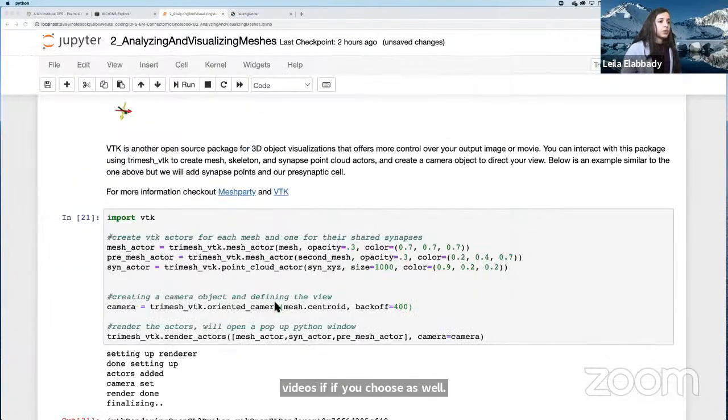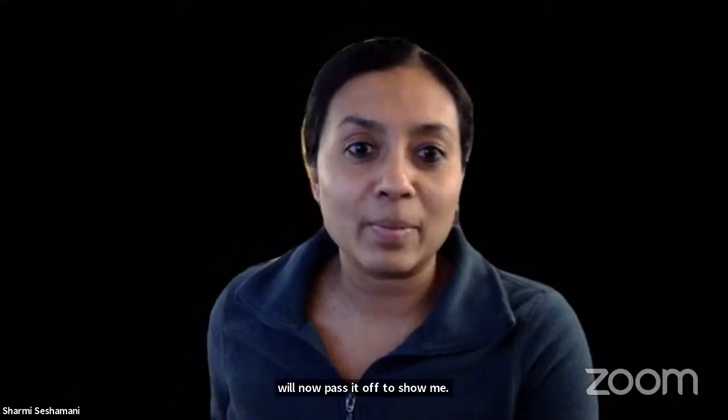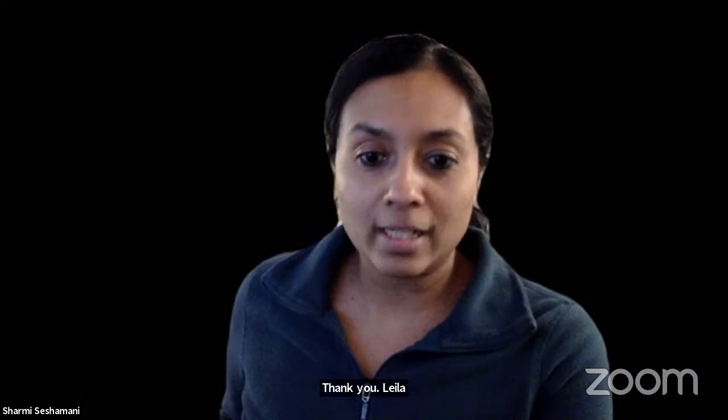Right. So that wraps up our bit on how to use meshes, both for analyzing them and visualizing. I will now pass it off to Sharmi, who will help wrap up the last bit of this tutorial. Hello, thank you, Leila. Let me share my screen.